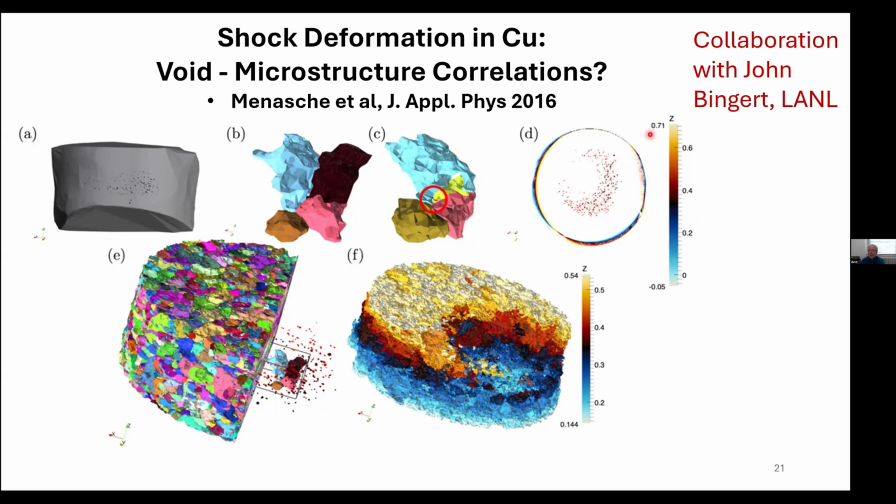If you blow it up, you can see that they're color-coded as to where they are in the z-axis in the vertical dimension. So yeah, this guy goes down there. Voids are in the neighborhood, and I believe David is showing here a little region close to at least 3 grains where voids occur.